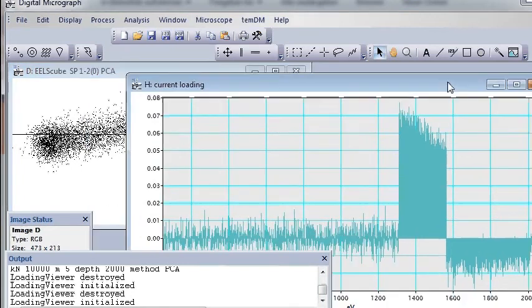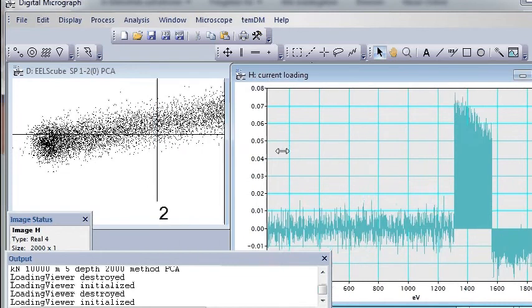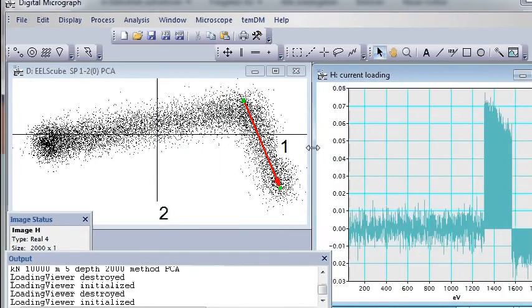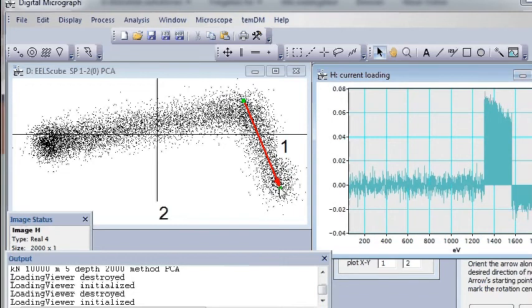Most conveniently, we find the right direction by looking at the live resulting loading. So here we play a little bit with the direction and we see how the loading changes, and we find the loading most logical to our mind. For instance, let's achieve here a smooth spectrum with no peculiarities.